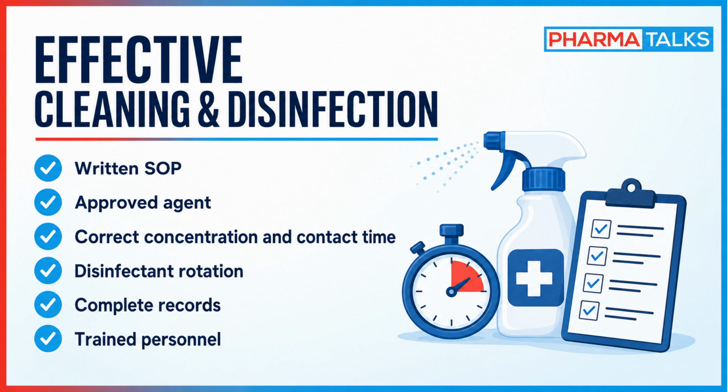Effective cleaning and disinfection. Effective cleaning and disinfection involve much more than selecting a chemical agent. A written procedure, an approved product, the correct concentration, sufficient contact time, and the proper application method are all essential. Disinfectant rotation should be based on risk assessment and validation evidence. Trained personnel must perform and fully document every activity to maintain traceability.